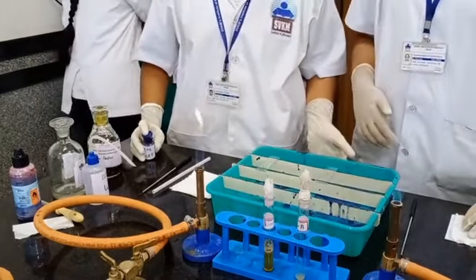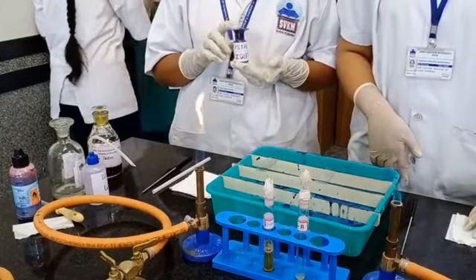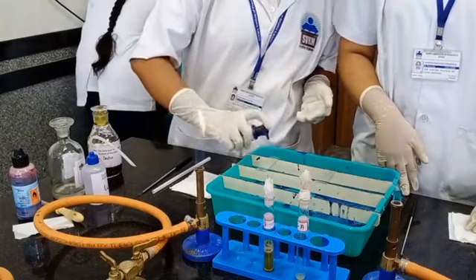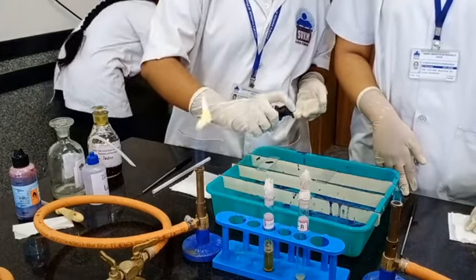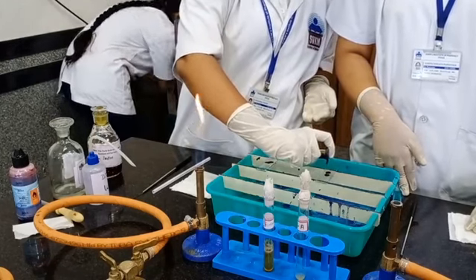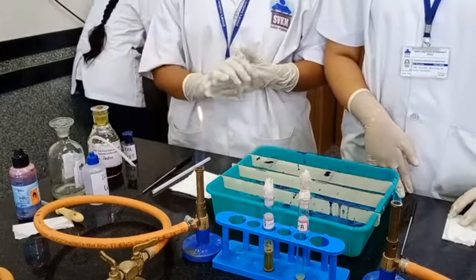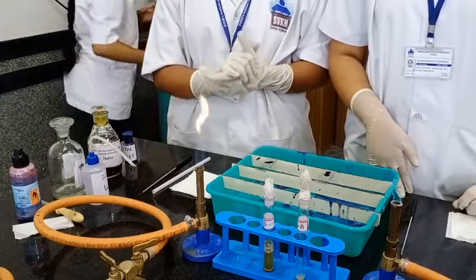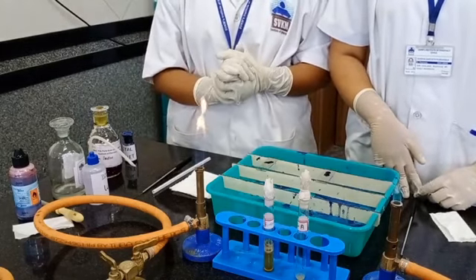Now after heat fixing the slide, we have to add crystal violet reagent. It acts as a primary stain. 2 drops of crystal violet are to be added. We have to wait for 2 minutes so that the crystal violet stain is retained on the gram positive as well as gram negative bacterial cell wall.